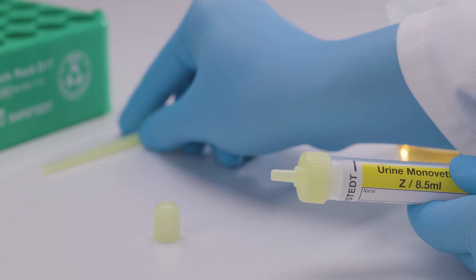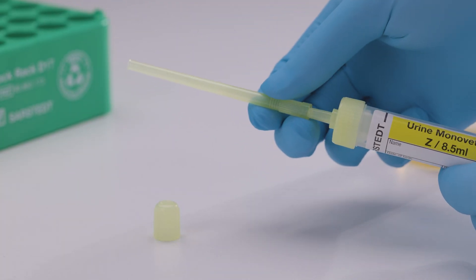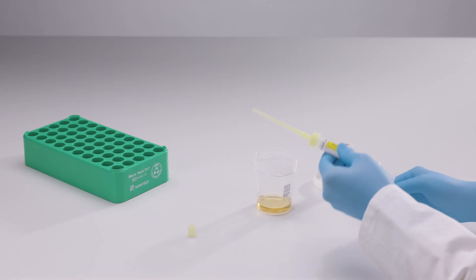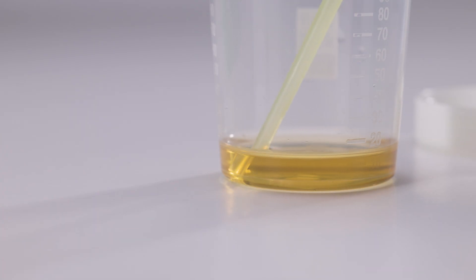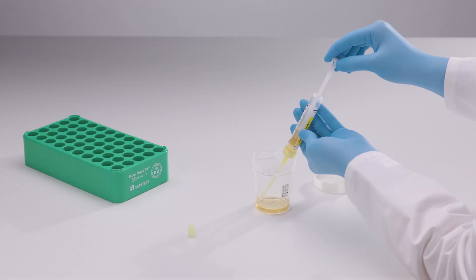Attach the collection tip to the Urine MonoVet. Insert the tip of the collection tip into the urine sample. Slowly pull the piston back until it reaches the line at the bottom of the label.